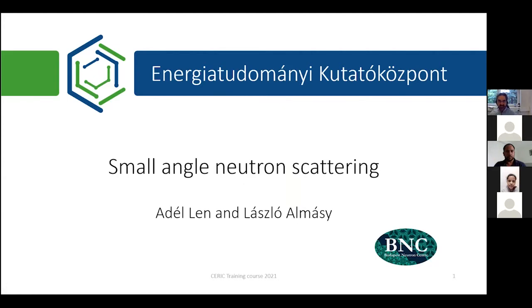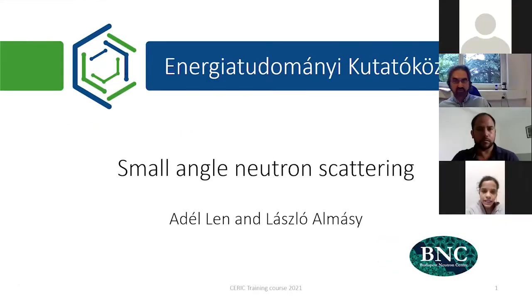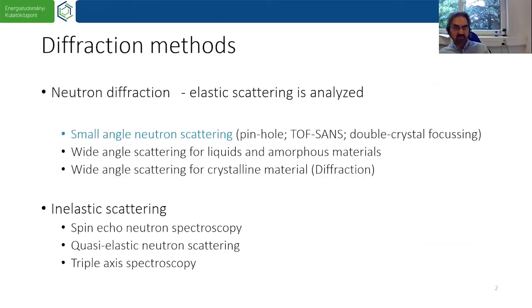So we shall see some basics of small angle neutron scattering. This presentation was prepared by my colleague Adele and by myself, and it is not to repeat what you have already heard, but just to re-emphasize the important things which must be remembered. So the first slide is about diffraction methods in general.